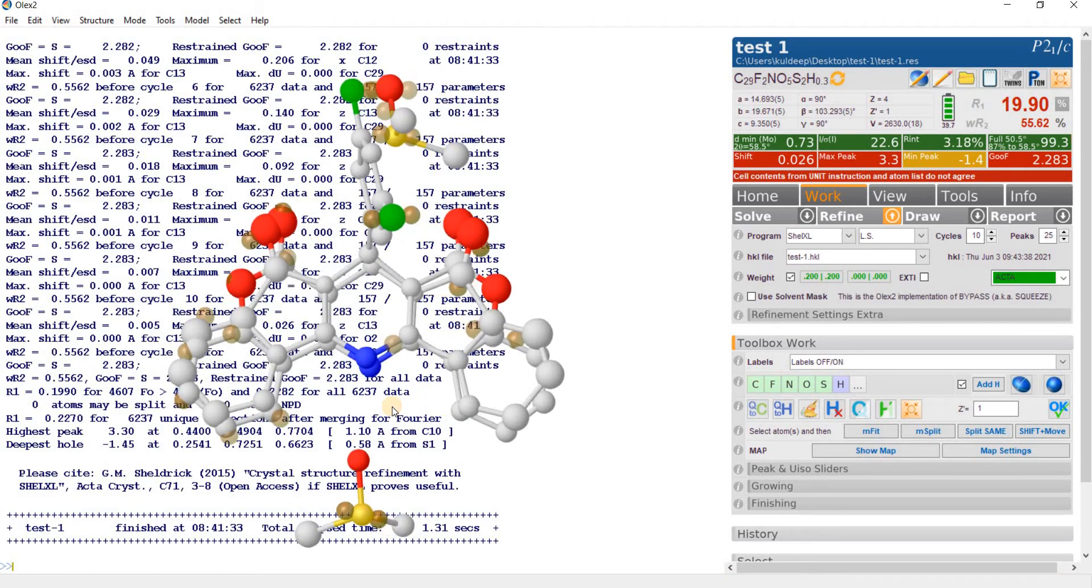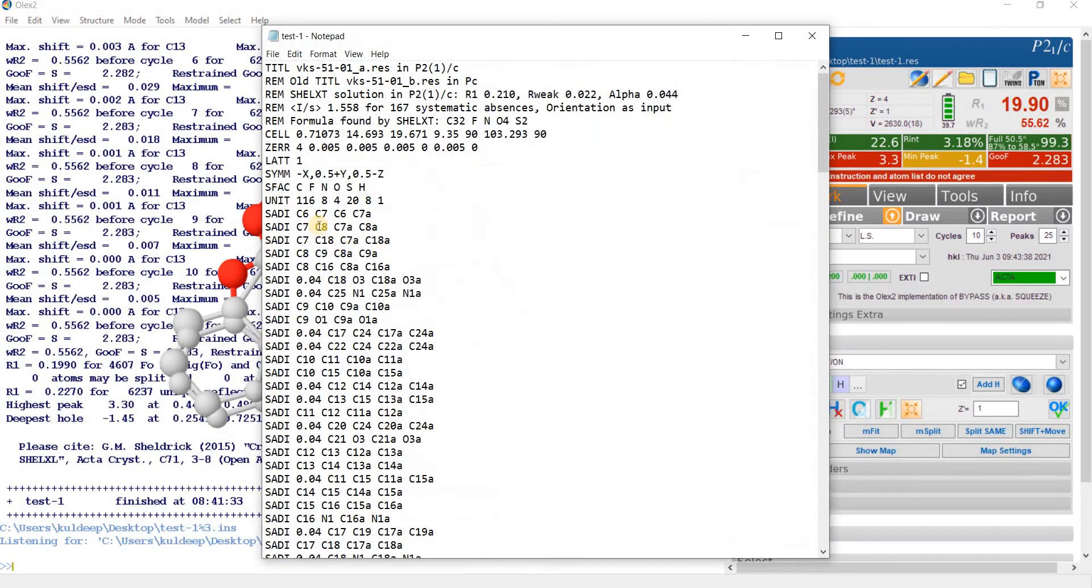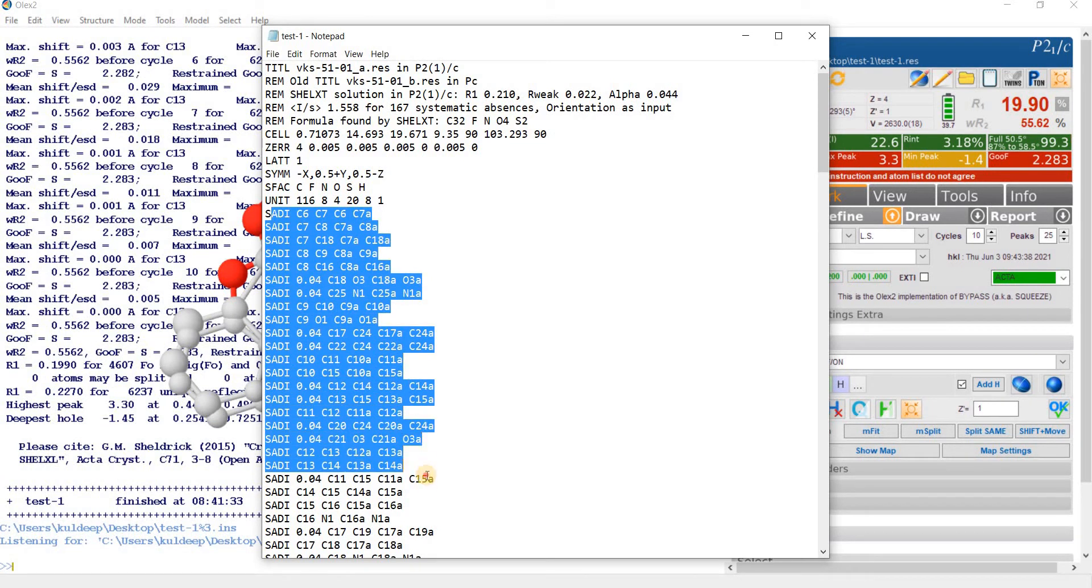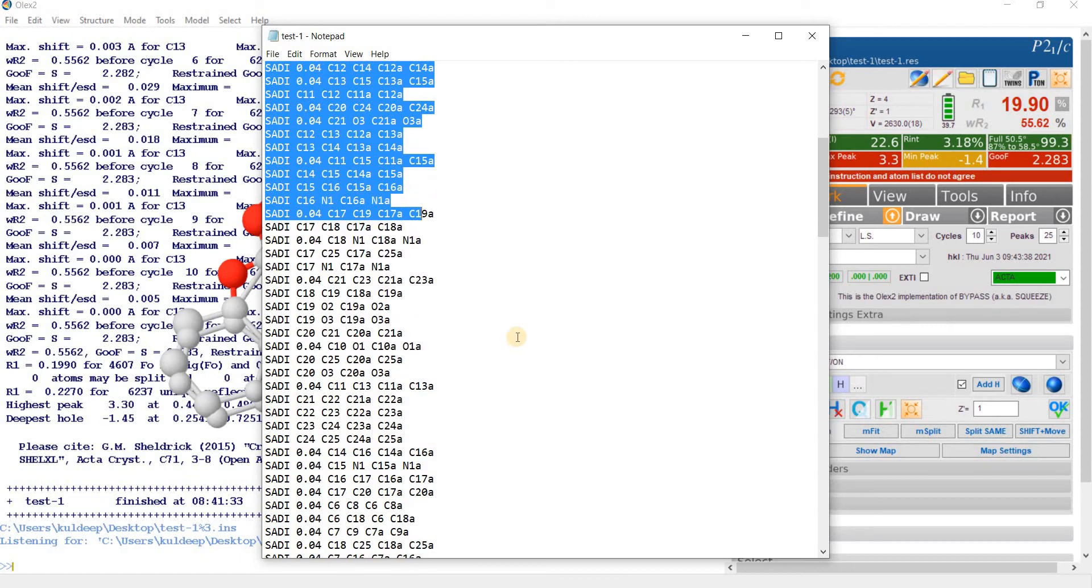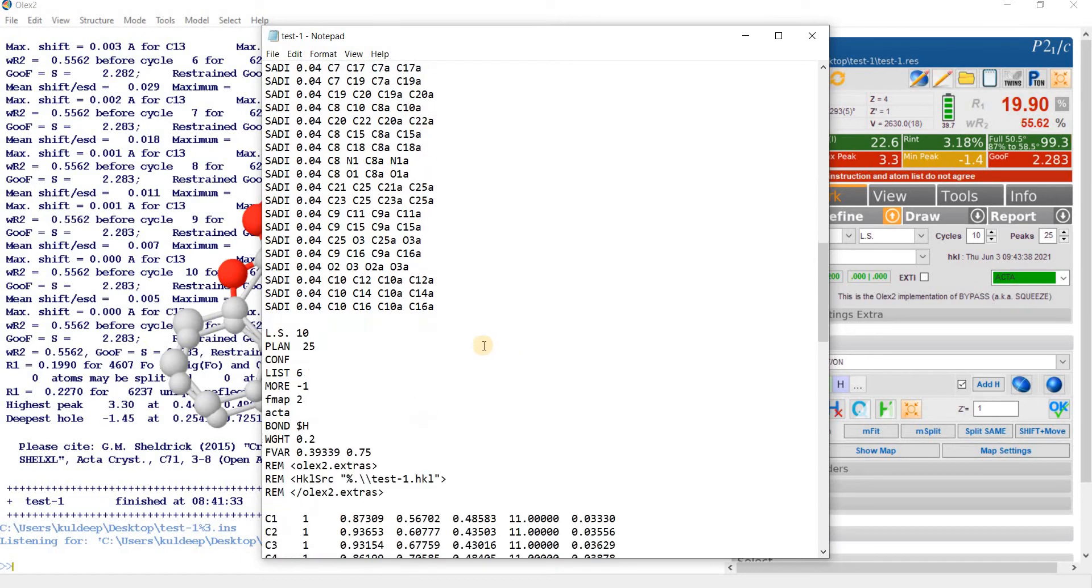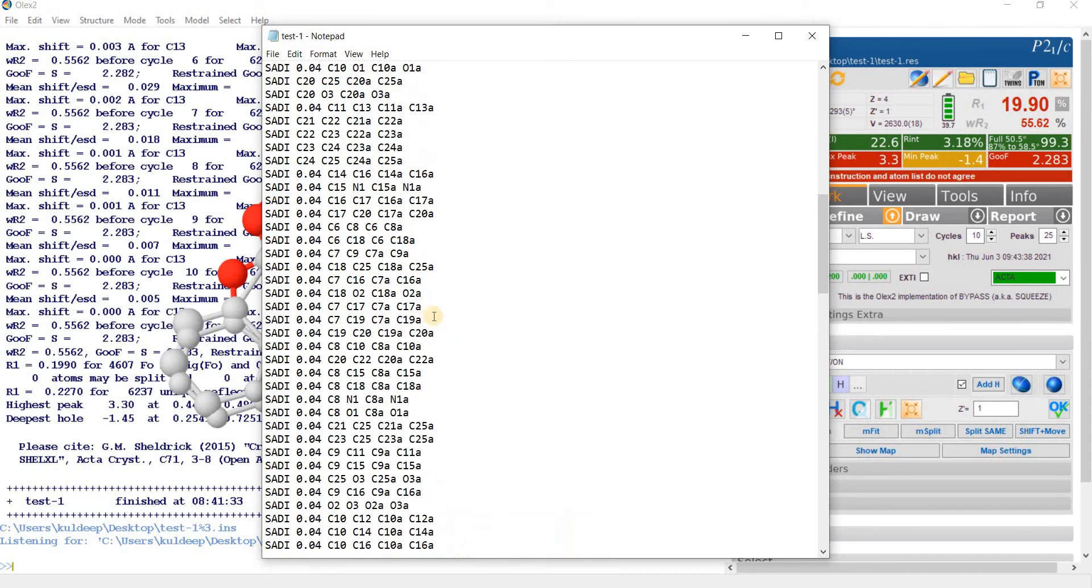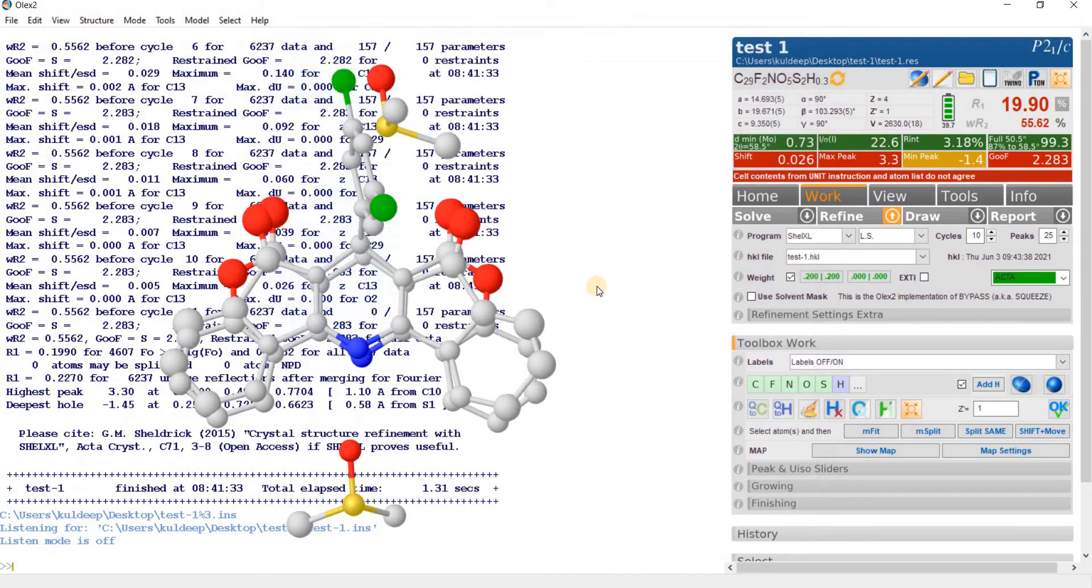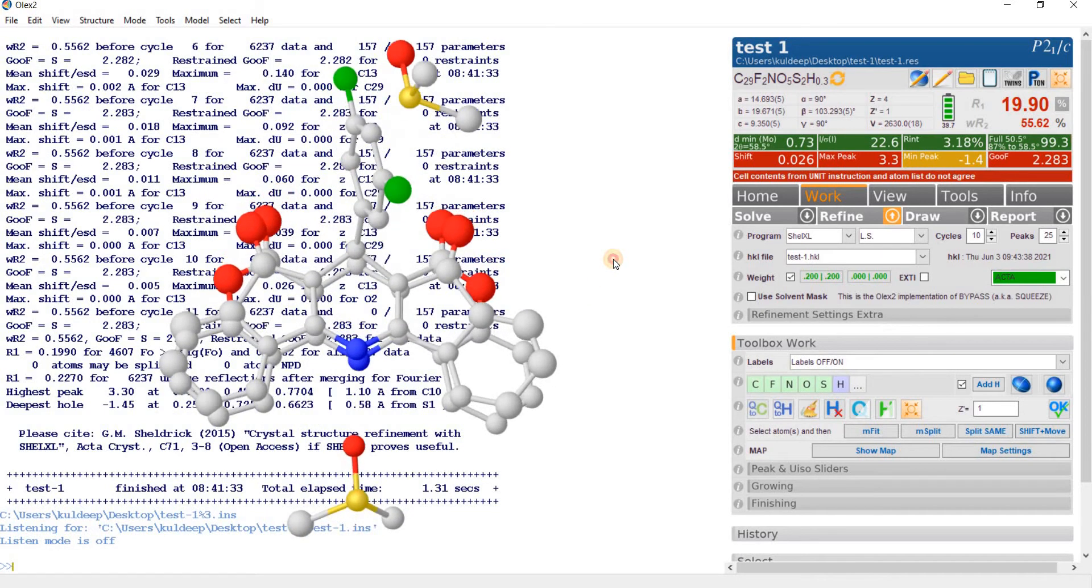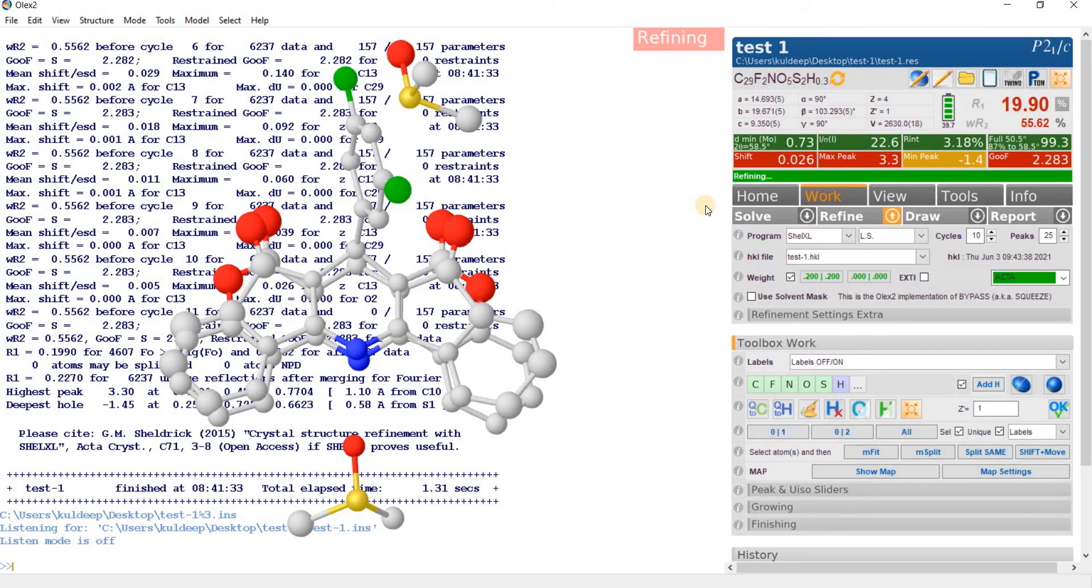Just go to the INS file and you will see a number of restraints automatically returned into the INS file. You need not to type them manually. Go back and now press the button refine. Now you can note the R factor is around 20% and now refine.